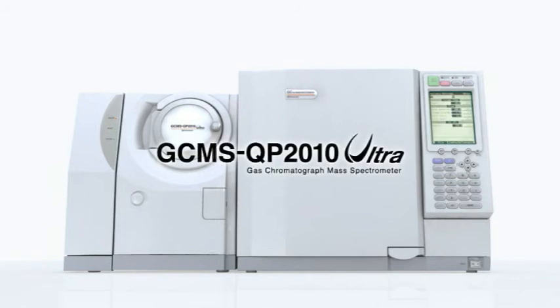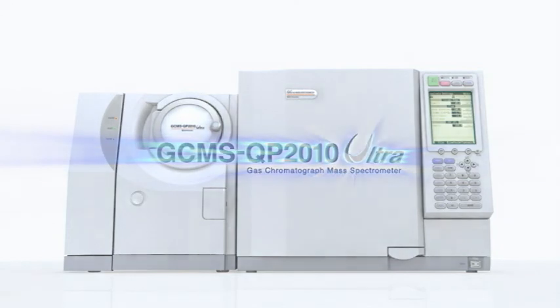The GC-MS QP2010 Ultra is without question the best gas chromatograph mass spectrometer in its class.